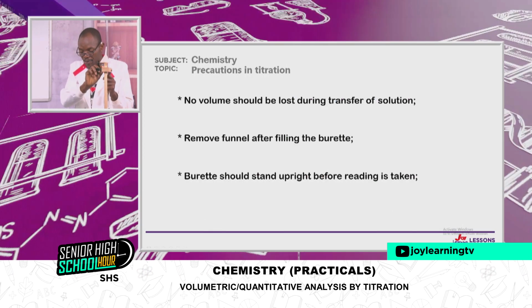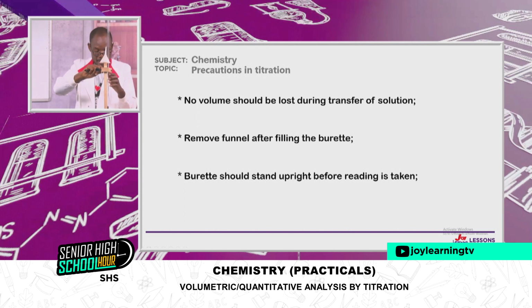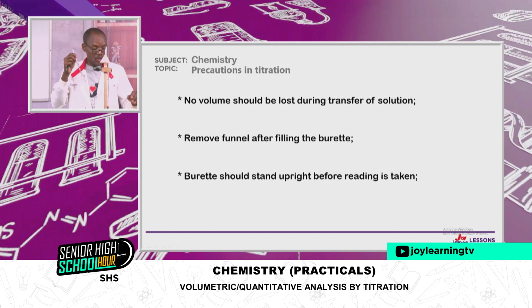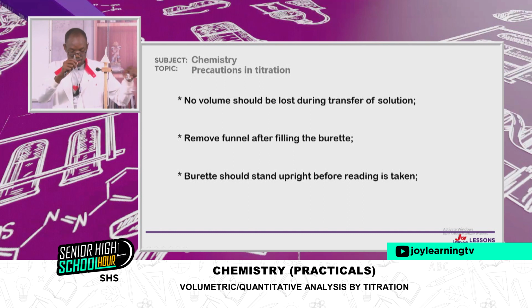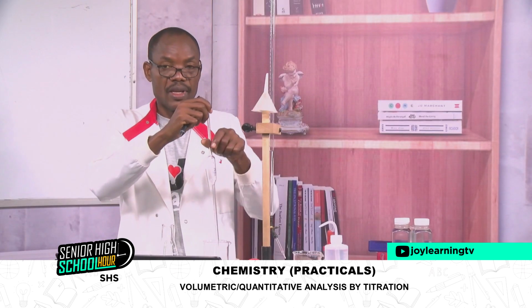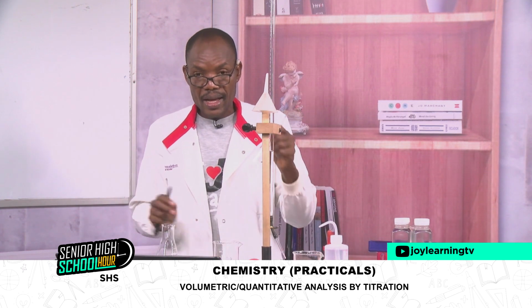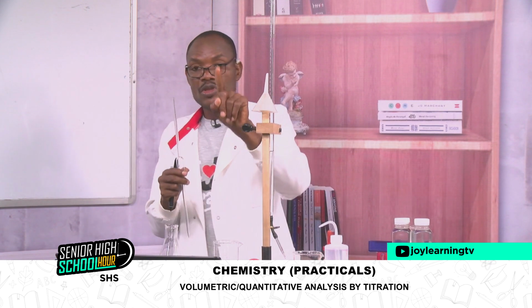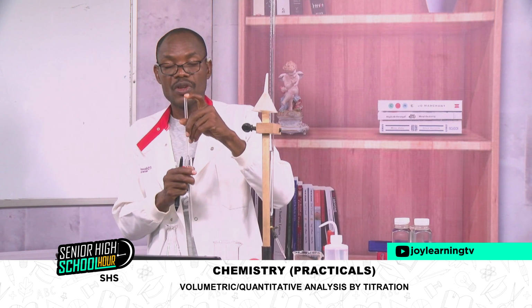No volume should be lost during transfer of solution. So that transfer of solution, you are using the pipette. You need to take it from one point to the other, so from the beaker into the conical flask. You are going to use your index finger to seal the top of the pipette.